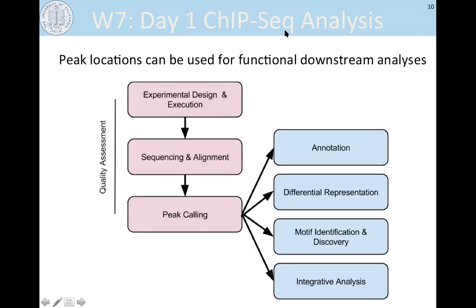I have a quick question. Okay. So does that mean that when you're comparing samples, say your control versus whatever you chip, the read depth between those two samples should be similar? Otherwise, it would be difficult to compare when you're calling peaks after normalizing.